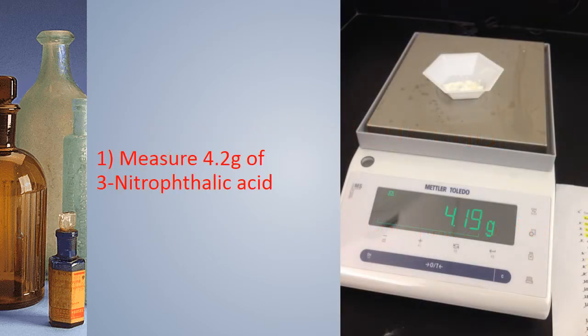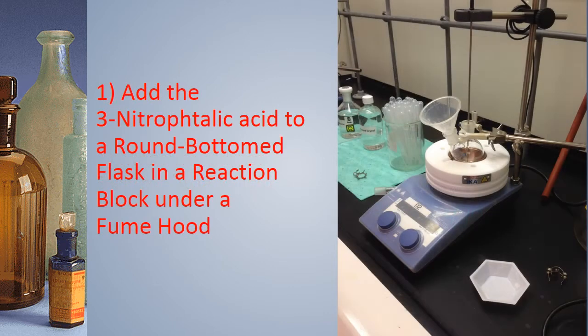The first step is to measure 4.2 grams of 3-nitrophthalic acid. We add this 3-nitrophthalic acid to a round bottom flask in a reaction block under a fume hood.